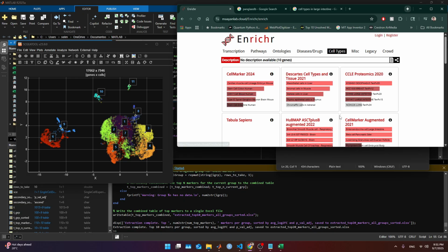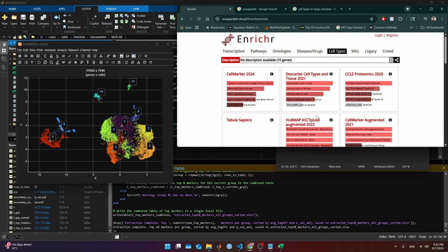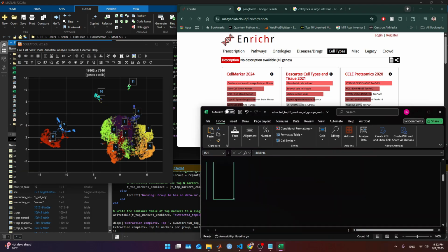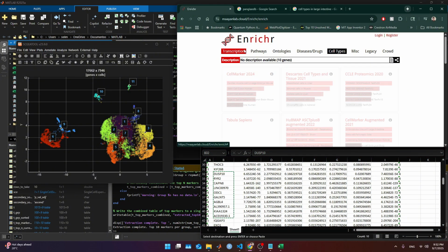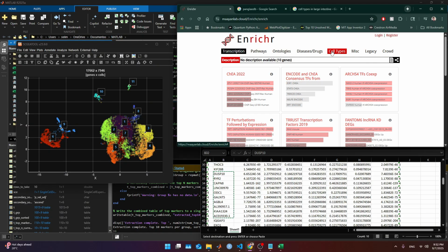So we just roll back here and we start looking around if something makes sense to what we saw in the picture diagram. Well, so far, still I believe everything here is colonocytes, but we have to still keep looking. Let's look at something different at this point. If we come back here, I can look at the fourth cluster, but I think it's gonna point out something similar to be intestine related, stem or colonocytes. I'm not really worried about that.